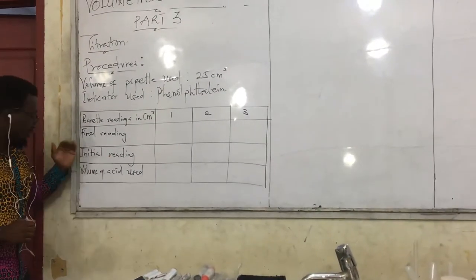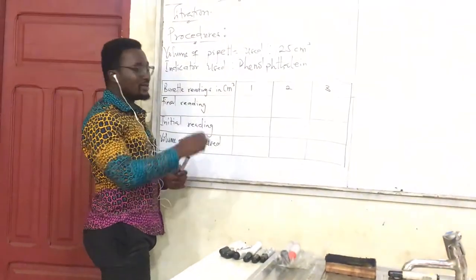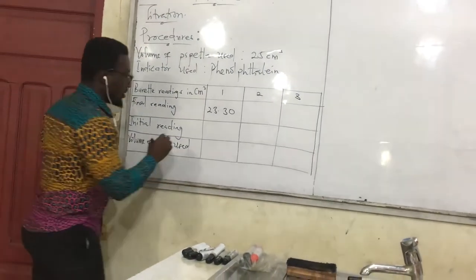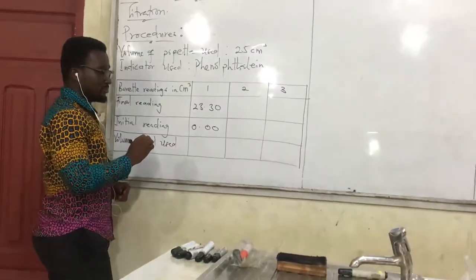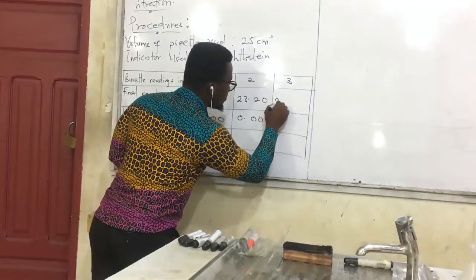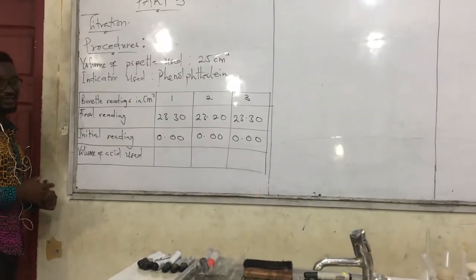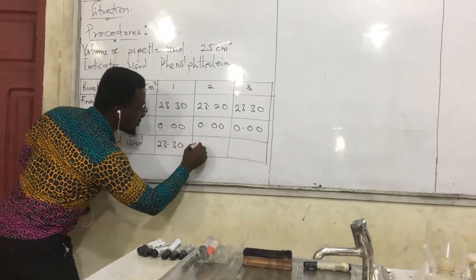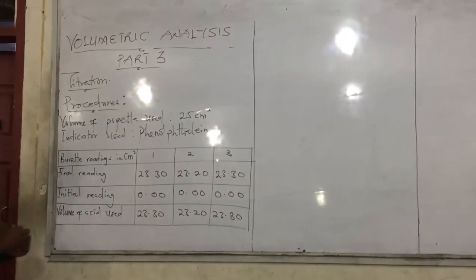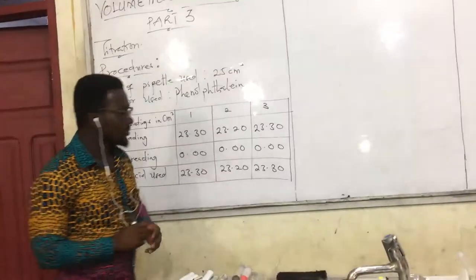So we have our final reading, initial reading, and then volume of acid used. Our final reading, our madam said it was 23.30. And then our initial 0.00. And then the second 23.20, 0.00. 23.30 and 0.00. So the volume of the acid used, 23.30, 23.20, 23.30. So that is how we draw the table.